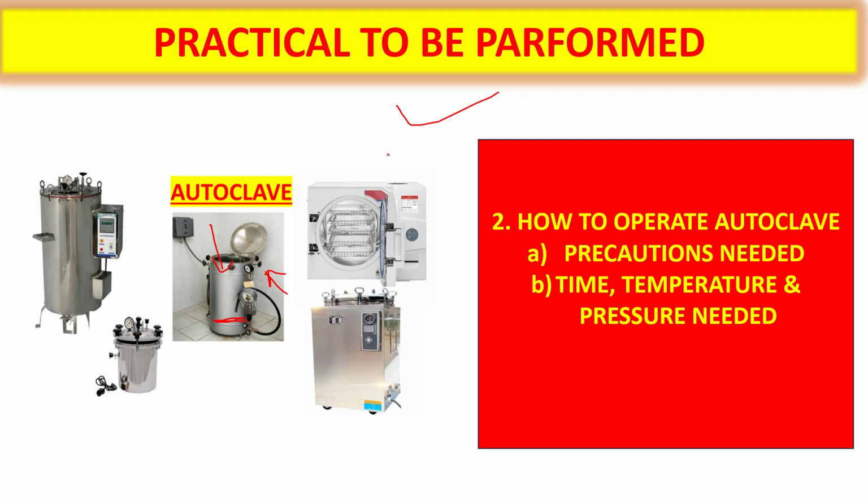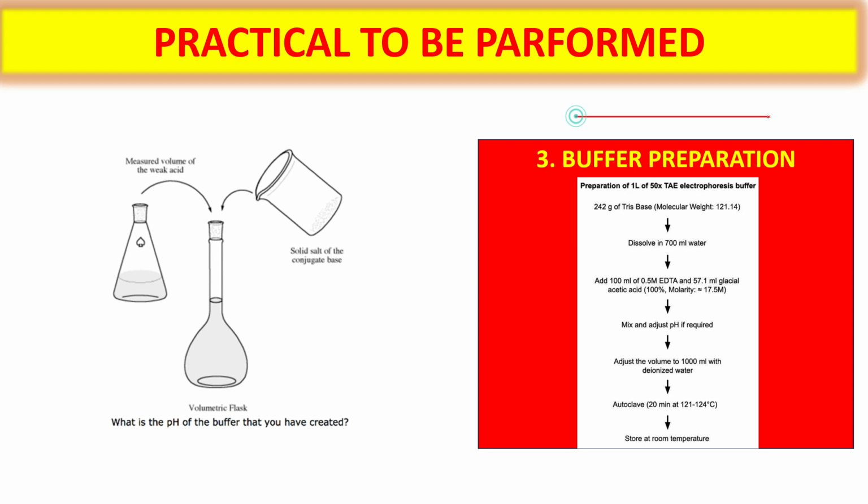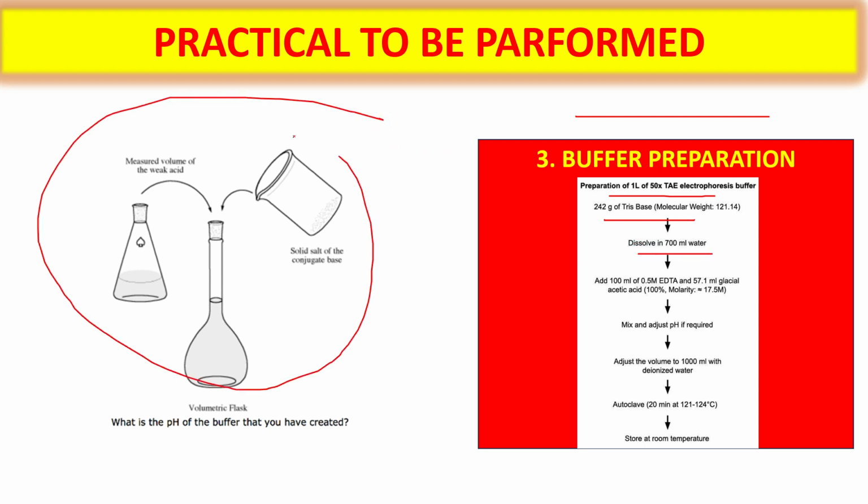So move on to the next practical, that is buffer preparation. You are given a chart and told to prepare a buffer. You are given all the instructions, that is, add this amount of base, this amount of acid, this amount of water, and we have to add all these things and prepare a buffer. Okay, so this is a practical.